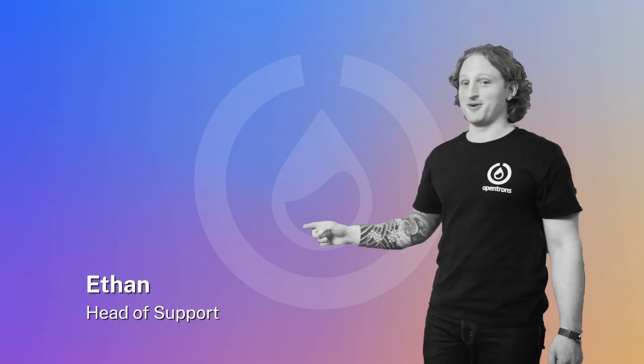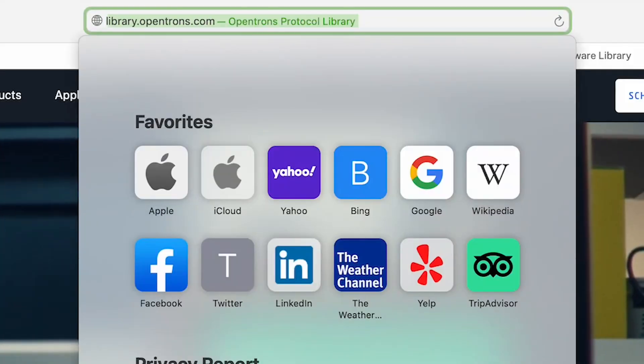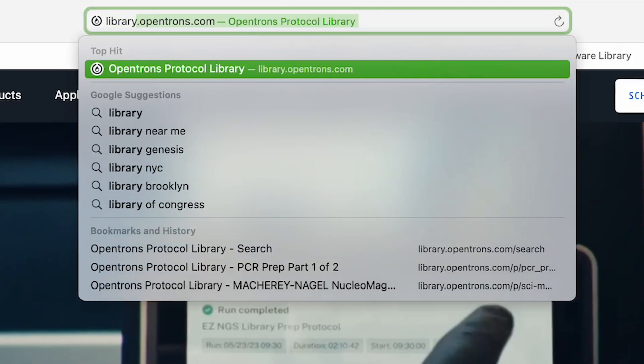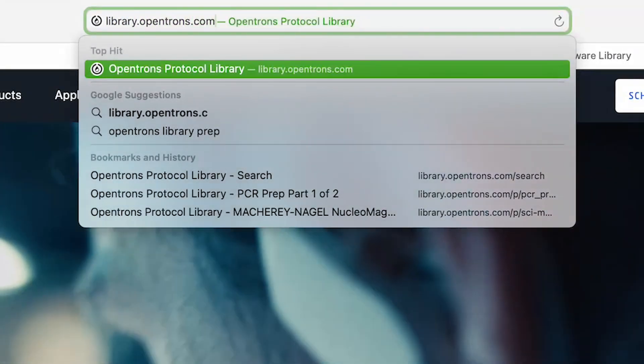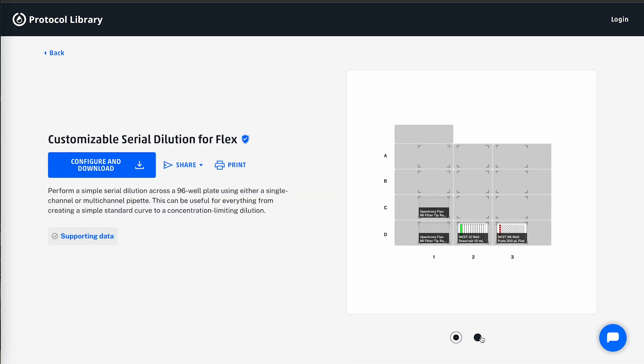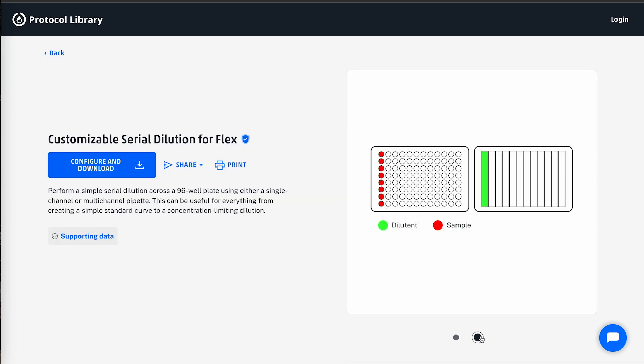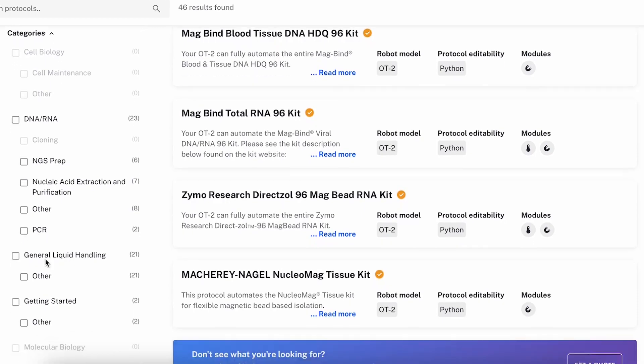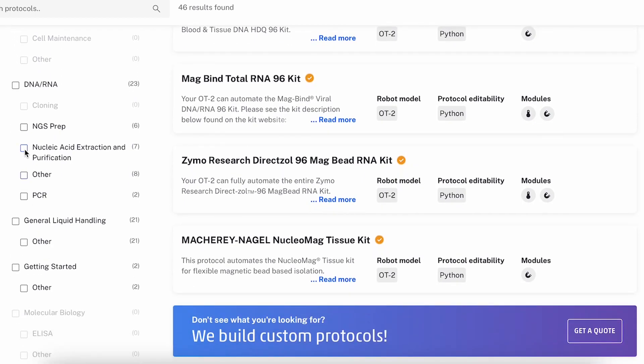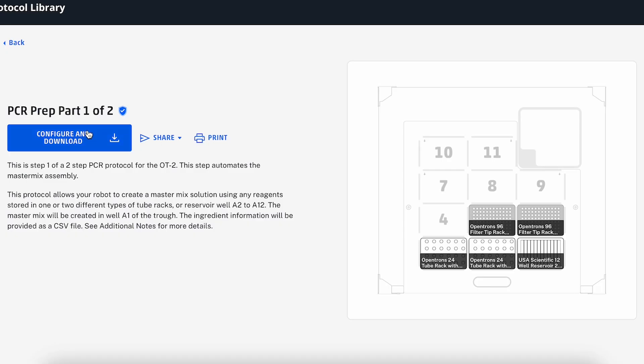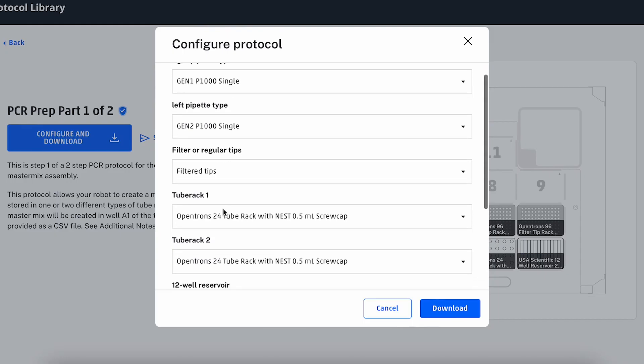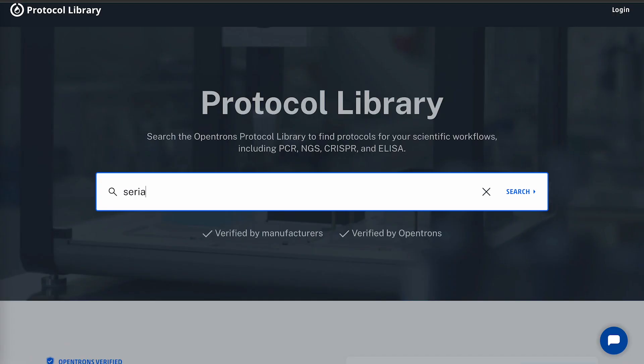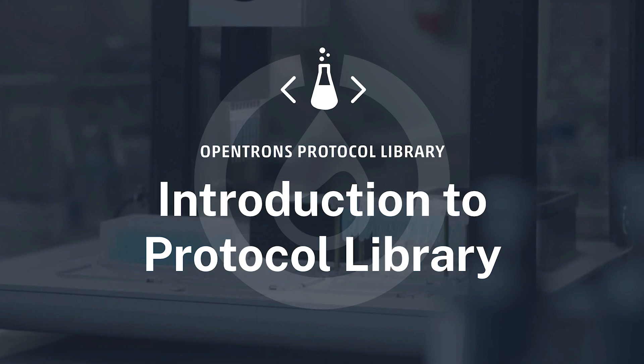Hello there, I am Ethan, the Head of Support at OpenTRONS. Today, we will look at the newly redesigned protocol library, a repository of pre-designed protocols covering a wide range of applications from DNA extraction to PCR setup. I'll walk you through the process of finding and downloading a protocol that fits your needs for your OpenTRONS robot.